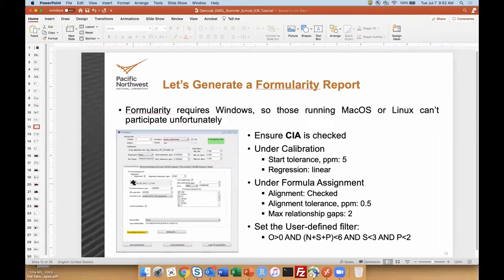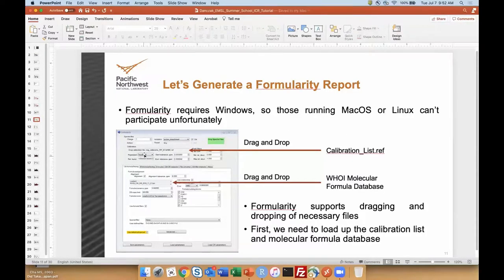Okay, so you do need to change the linear first. Okay, that's a good note. I guess it comes default as none, maybe. I thought it was defaulted as auto. Under this regression drop-down menu here, you need to change that to linear first. So there are other regression methods that you can use. We use linear due to convention.